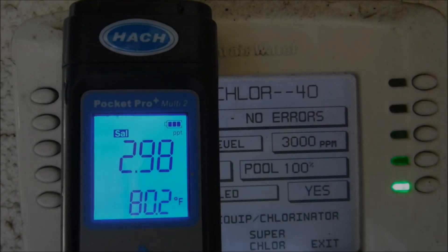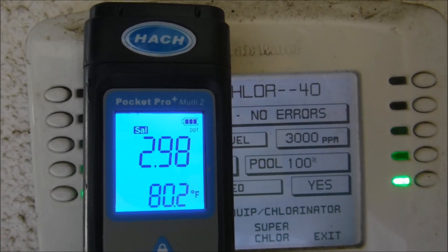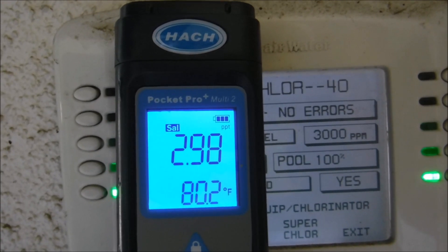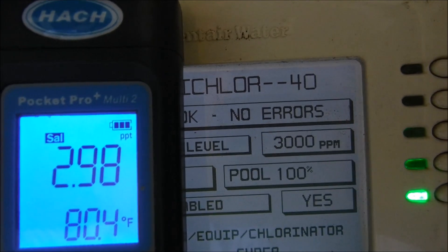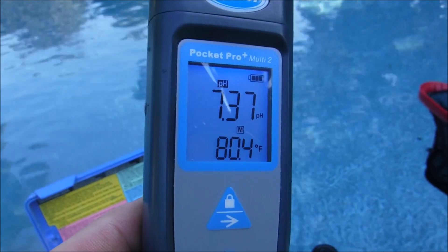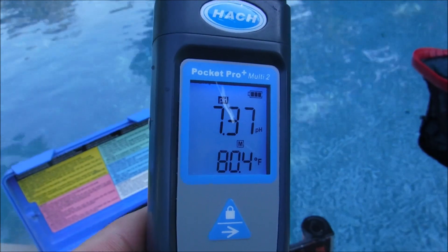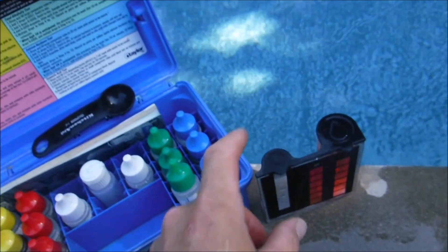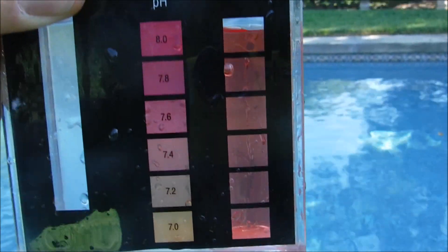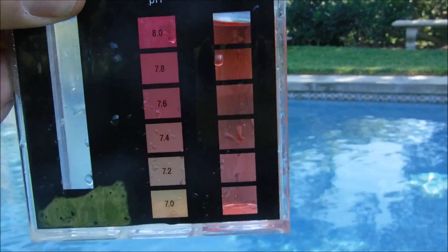The Hawk Pocket Pro testers are also very accurate. The salinity here is at 2.9 parts per thousand, which is about 3,000 parts per million — the same number I'm getting on this automated system. The pH is reading about 7.4 on this tester. I have my Taylor kit here and I did the Phenol Red test — it's coming in about the same, about 7.4.